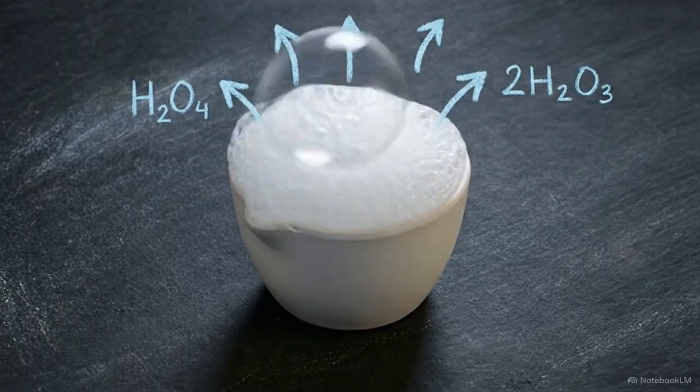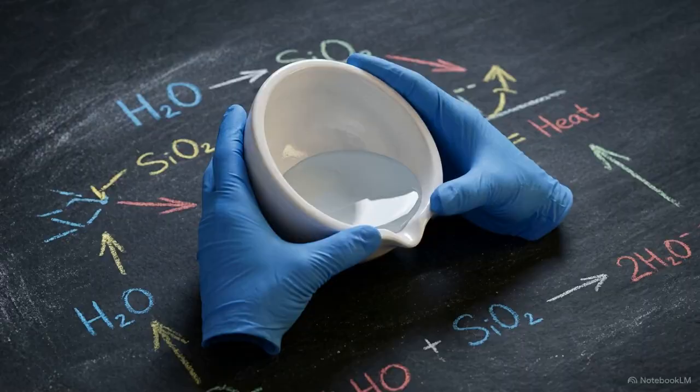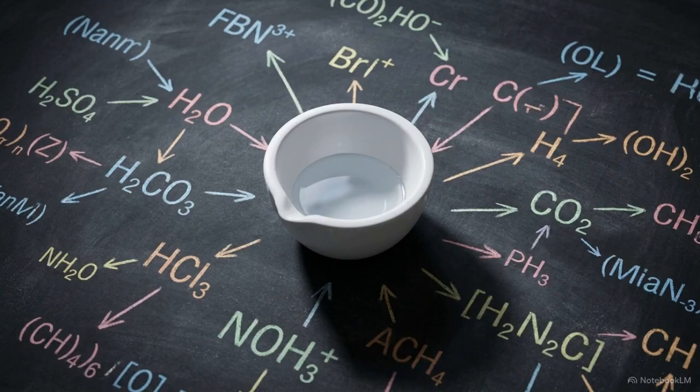You must wait between drops until all effervescence completely stops. Once there are no more bubbles forming, swirl the mixture gently to make sure everything has reacted. Then add exactly 5 additional drops of acid. This slight excess guarantees total conversion of the reactant. This highly controlled, patient pacing is required to prevent boilover. Keeping every droplet safely inside the crucible secures the physical mass we need to validate our math.